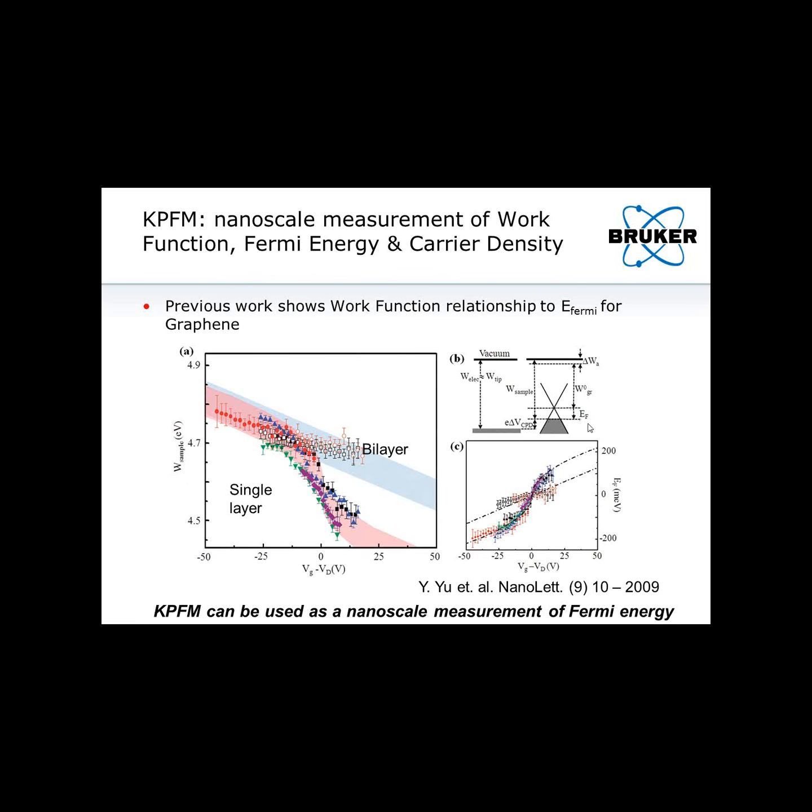And by tuning the gate voltage, they can move this Fermi level through graphene's band diagram, and they can find the minimum position from independent measurements. So they use a gate voltage, and they can figure out what gate voltage corresponds to the Dirac point right here in the middle.